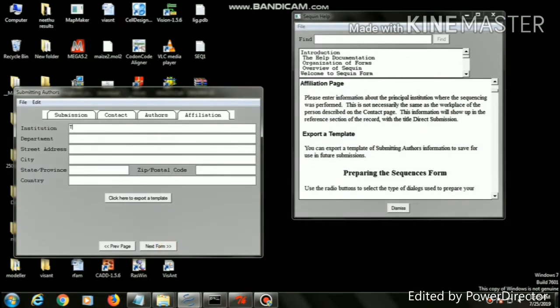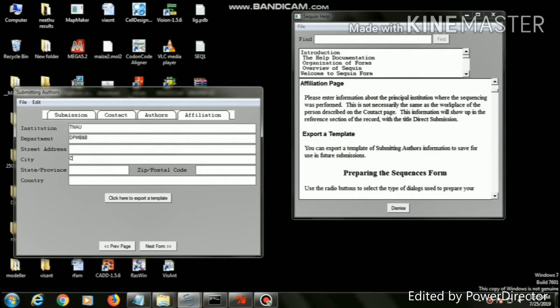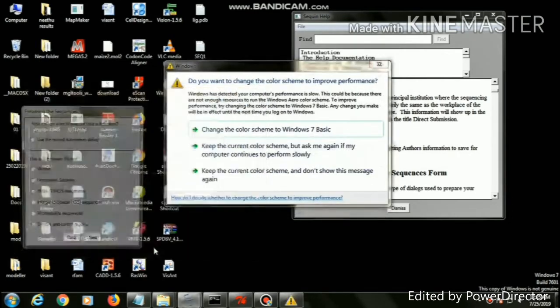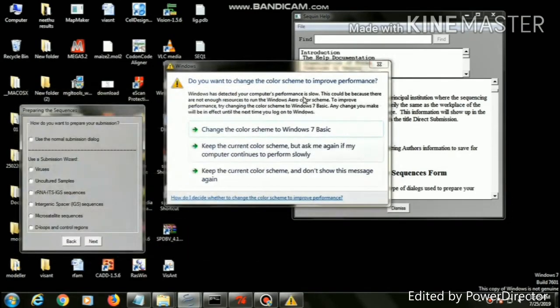Then give the author details and click next page. It will ask for institution name, department name, street name, city name, country name, state name, and postal or zip code. Then click next page. This information will show up in the reference section of the record with the title direct submission.